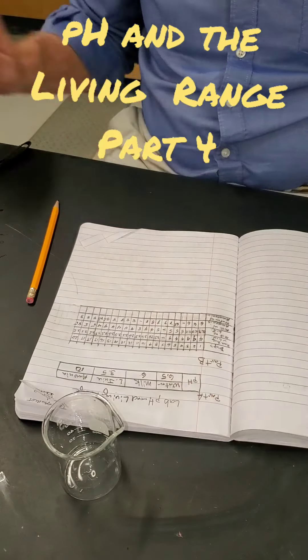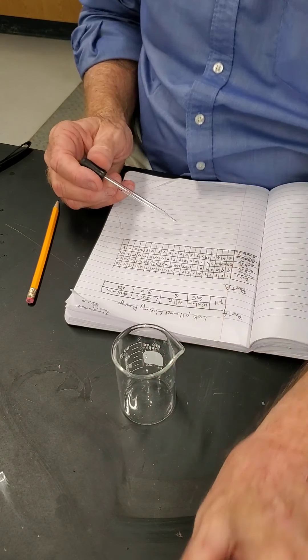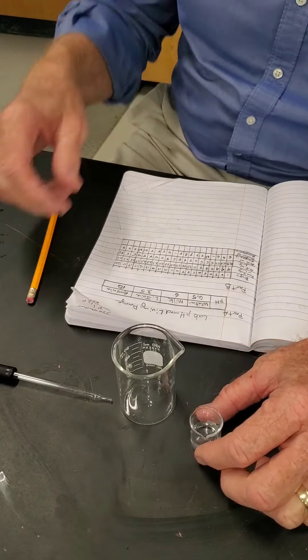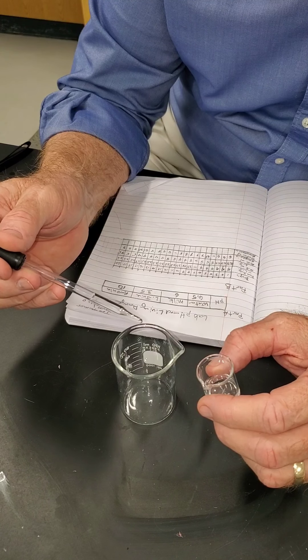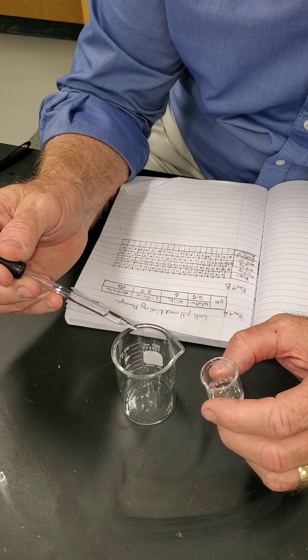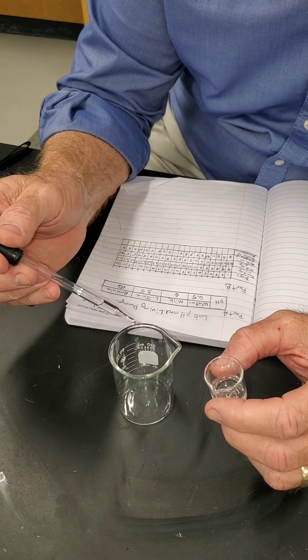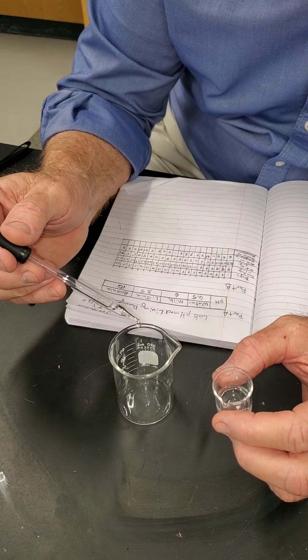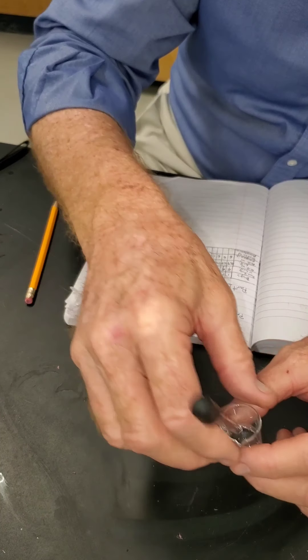We're going to take our water and add 20 drops of water, just like we did before, and then we're going to add 20 drops of ammonia to it. We count out 20 drops — that's our water.